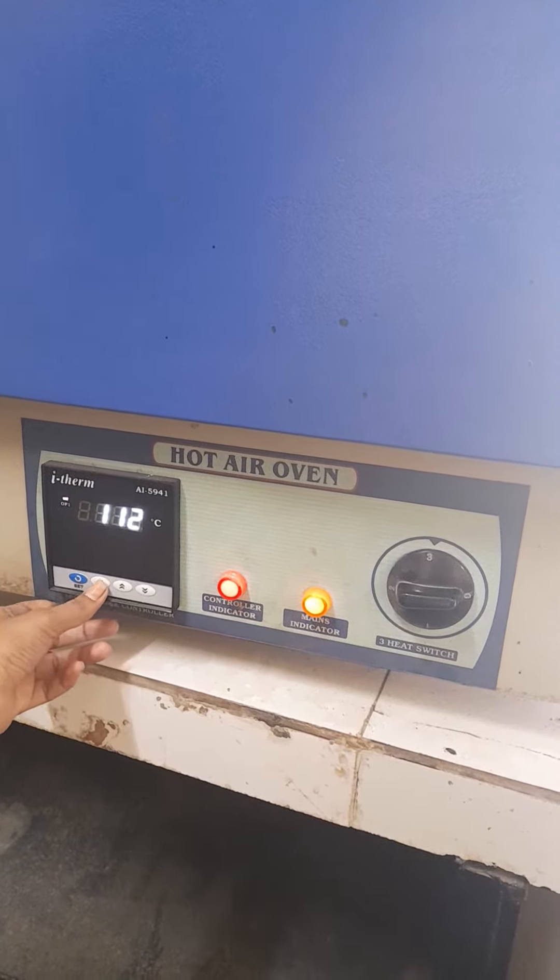The temperature should not be more than 180 degrees Celsius. The material which is to be dried or sterilized should be properly wrapped in paper craft before placing it in the oven.